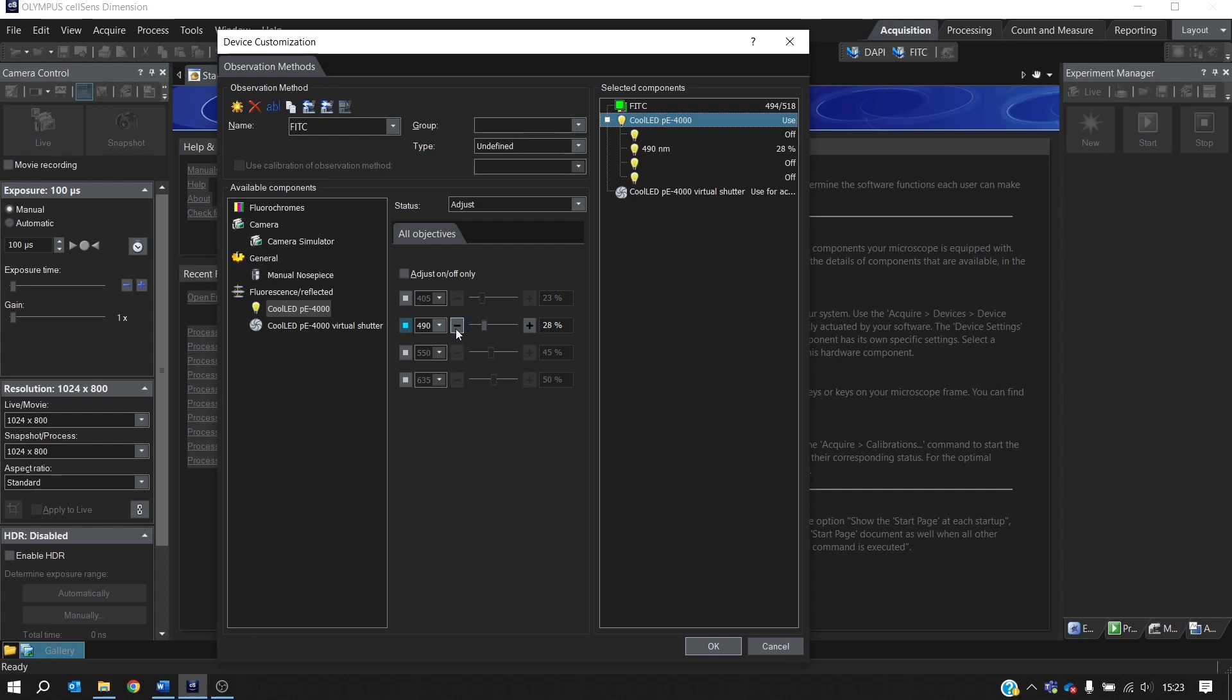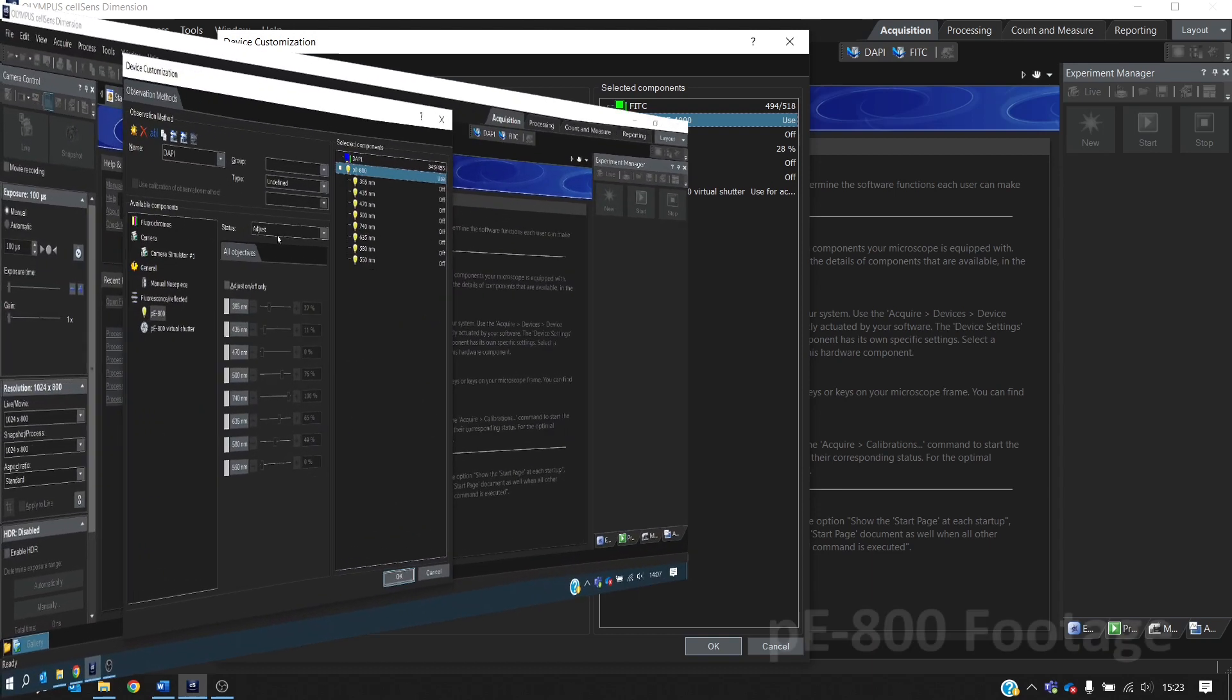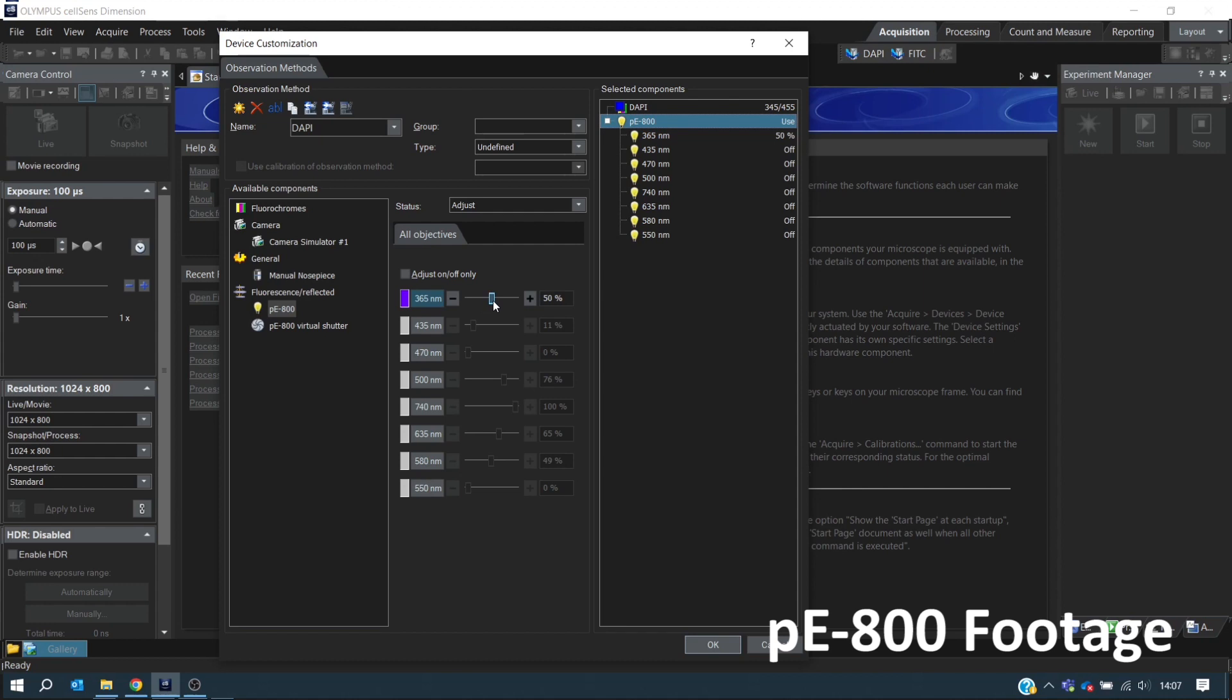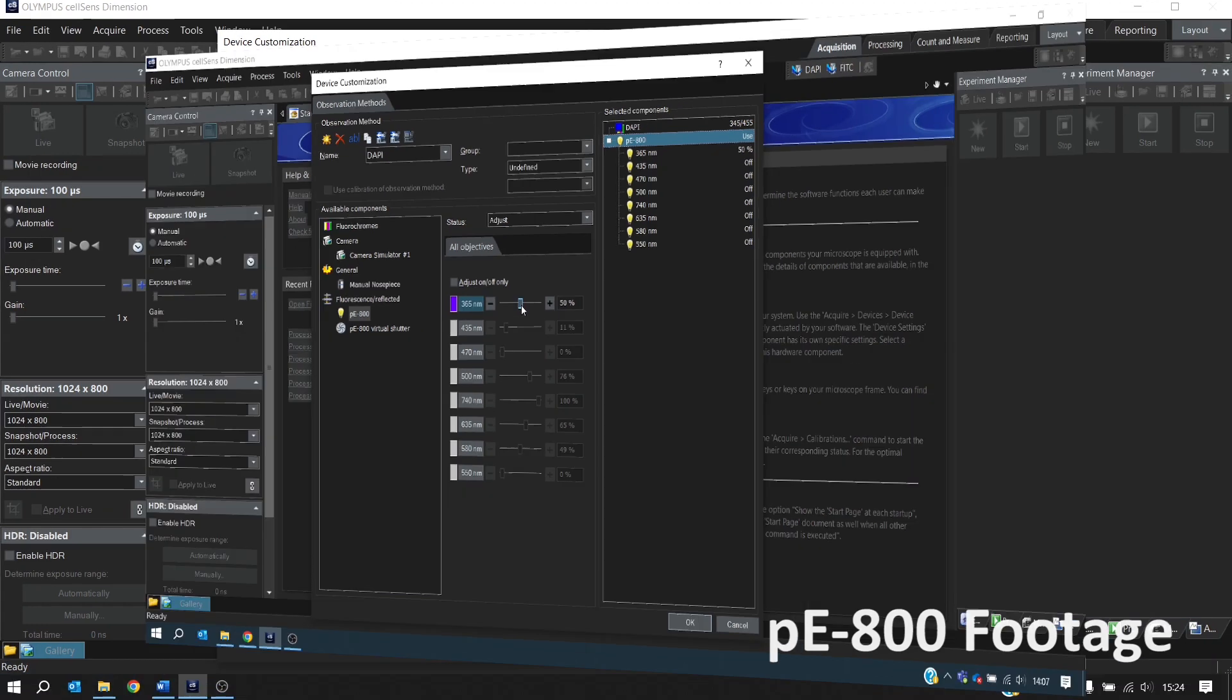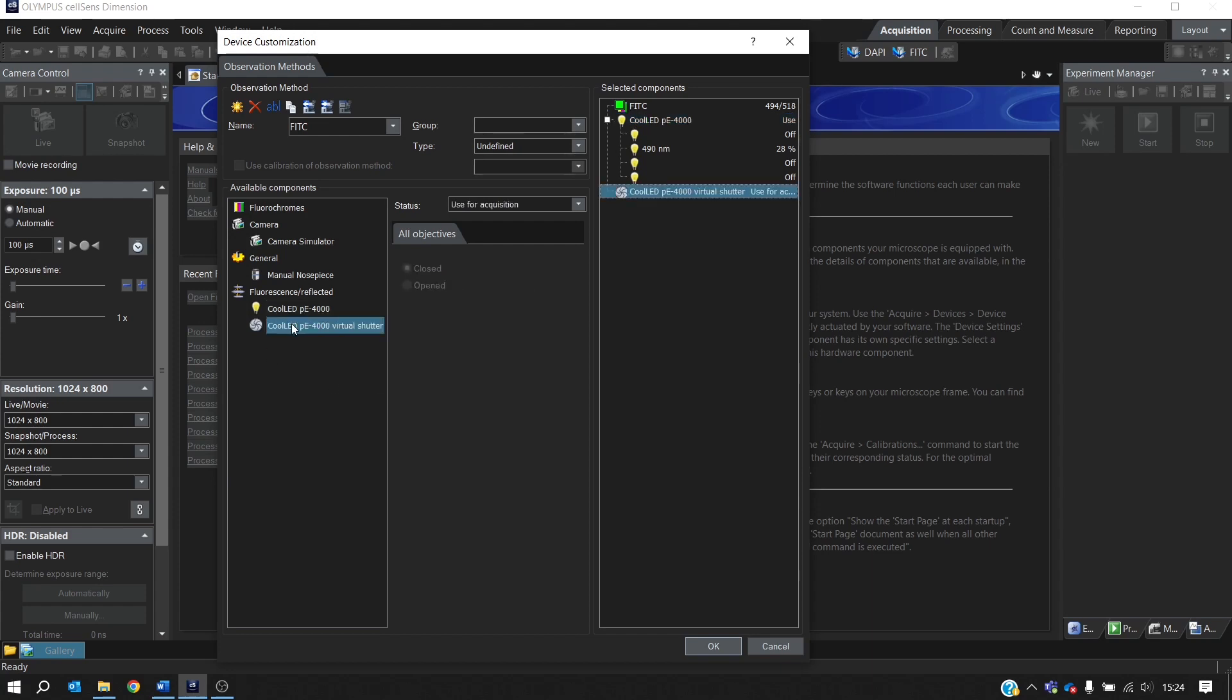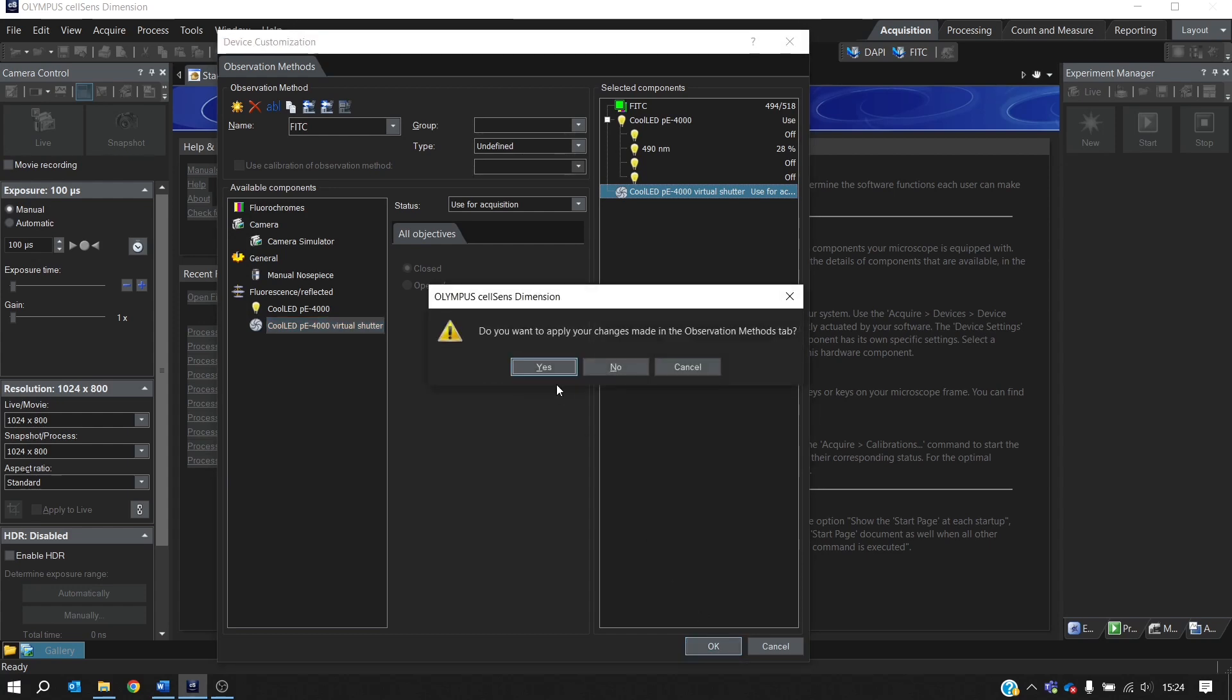It's worth noting that this drop-down menu is specific to the PE4000. For other Cool-LED illumination systems such as the PE800, what you'll see is a list of one LED per channel because the PE4000 is the only system that has multiple LEDs per channel. Again, we want to just check the shutter here. It's still on for use for acquisition, so we can click OK to save our settings.